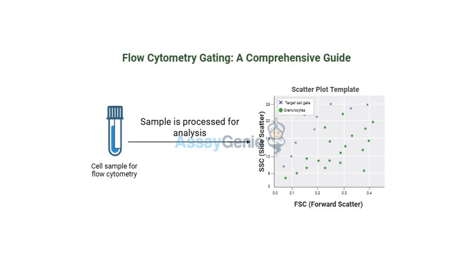So it's like picking the right detective for the case. Sometimes you need a specialist. Exactly. And one of those special approaches is sequential gating. It's kind of like peeling back the layers of an onion. We can see hidden stuff within our cells. Oh, I like that. So we start with a broad gate to capture all the suspects, and then we slowly narrow it down using more markers.